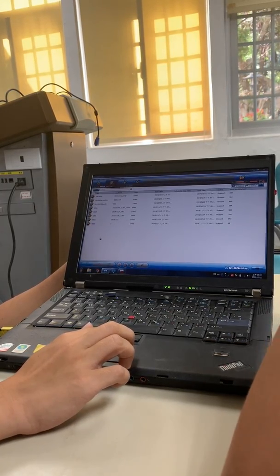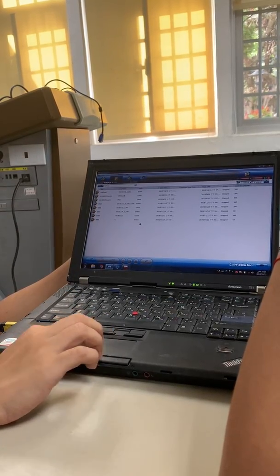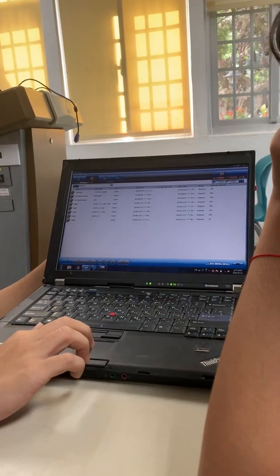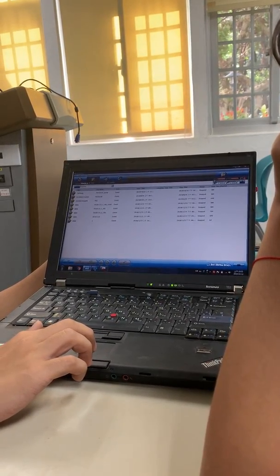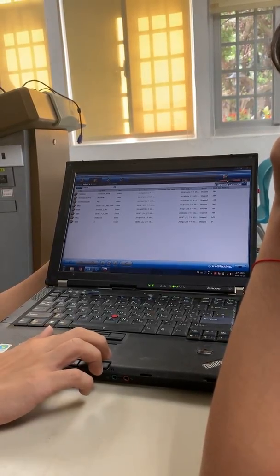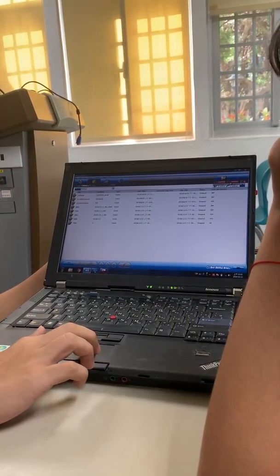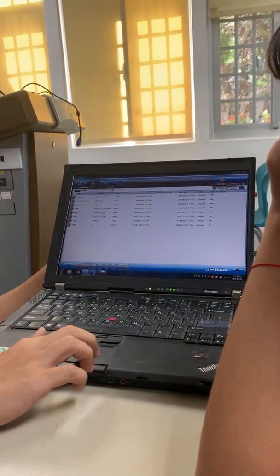Here you can see the previous experiment. There are two important indicators: one is memory — showing how much empty space remains — and the other is battery. Right now you can see the battery is about 20% left.